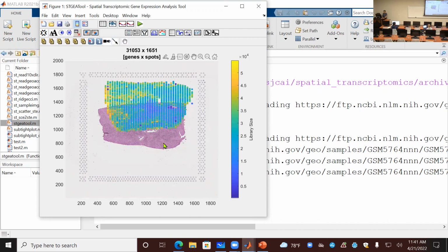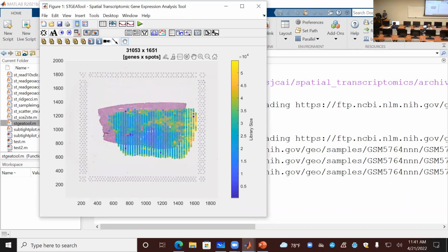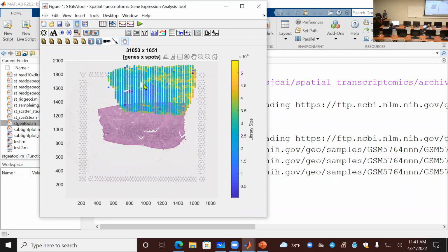This circle should be here. Yeah, so I think that's the correct way. What do you think? This sample is really weird. I mean, normally I will look at the bubbles here and match those. Also the shape, for example, this shape here is a curve, should be here actually.